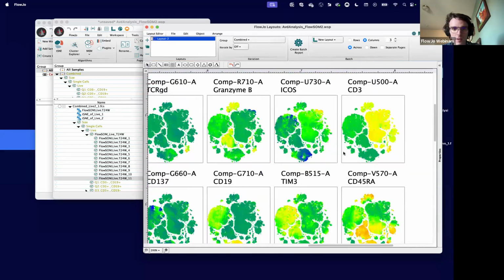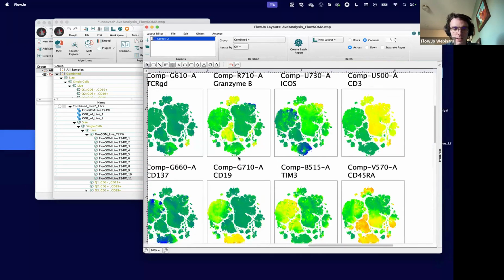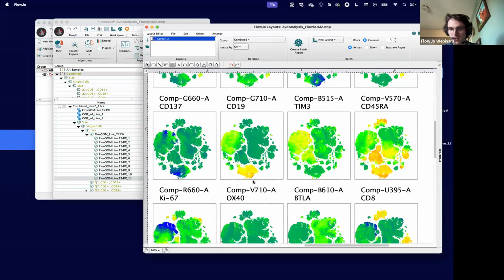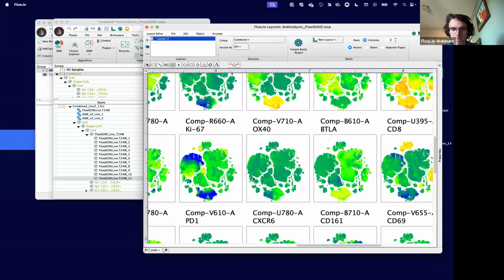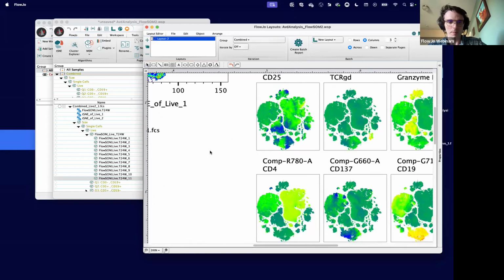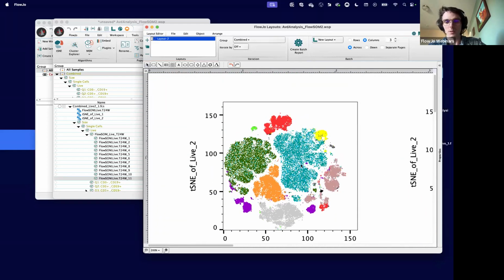But let's look further at some of our specific markers. CD19 is down here. It looks like that's maybe some monocytes picking up some background signal. And then let's see, CD4. Okay, so CD4 is this group here. I think that corresponds to basically one of my big populations in the clustering results, maybe two of them actually. So these two populations are my CD4 cells, probably.